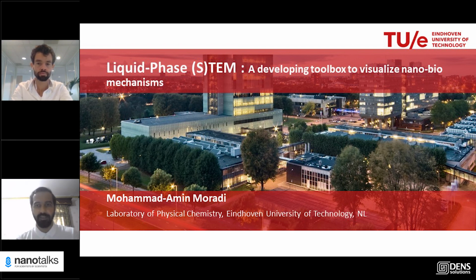Yes, that's the thing. I actually didn't show the system yet because we're working on that. We decided at the end not to show the results because I don't know what they want to do with the results regarding the importance of the work. But yes, we want to push the water because the pockets there are pretty small, so the water is pretty static.